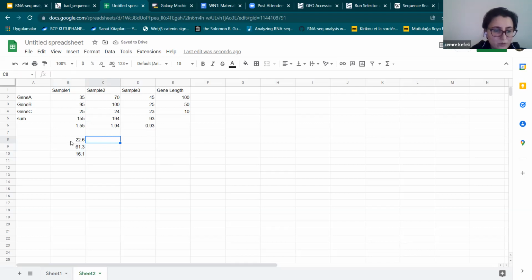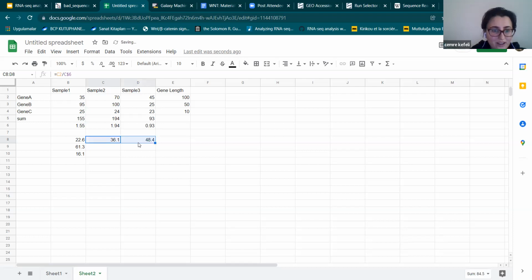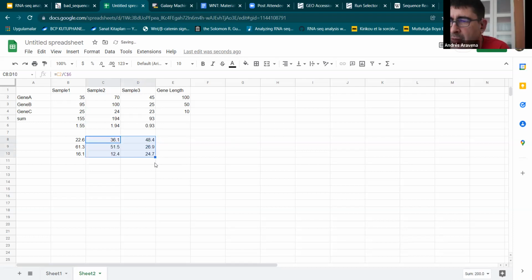And now I have to do, can I go like this? Is it true? Yep. No, it's not. No, it is. Double click it. Yeah, click it. Can I go like that also? Yes, and down. Yes.